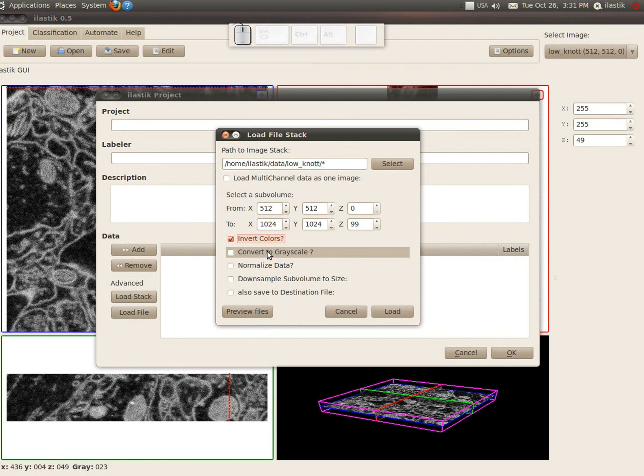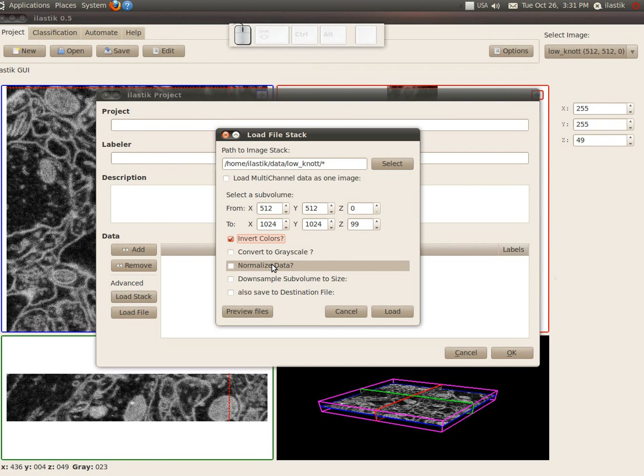We could convert to grayscale, but here we don't have to because the data is already grayscale. One can also normalize the data, which means that the maximum of the data intensity values become completely white and the minimums become completely black and the rest is stretched between black and white.